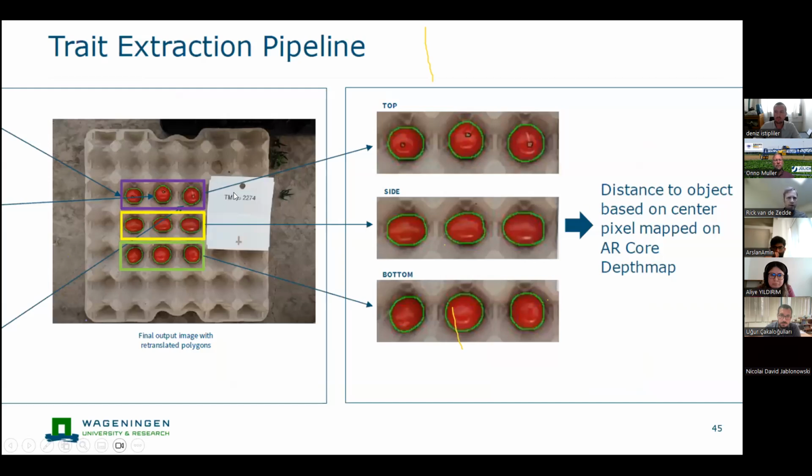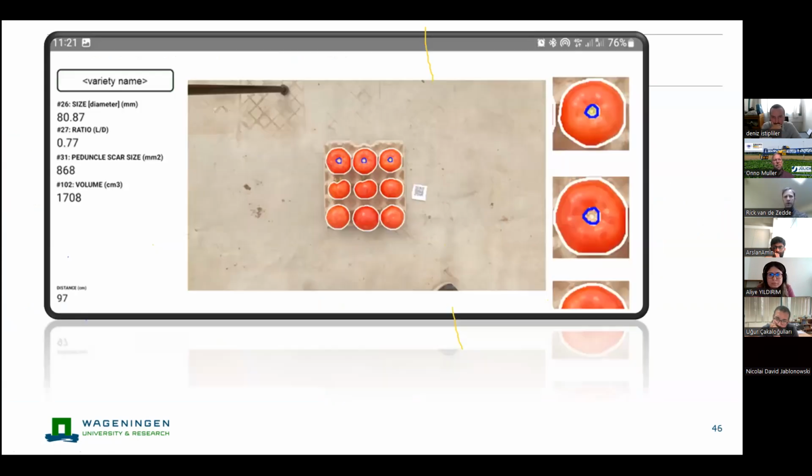And this is the orientation analysis AI model, but basically a matter of training. And you generate numbers. And this is a very scalable tool that can be handed out to users all over the world, instead of going to our fancy facility where actually it's difficult to get there, and it's also difficult to constantly use these tools. This is ready to be used within weeks or maybe even days.